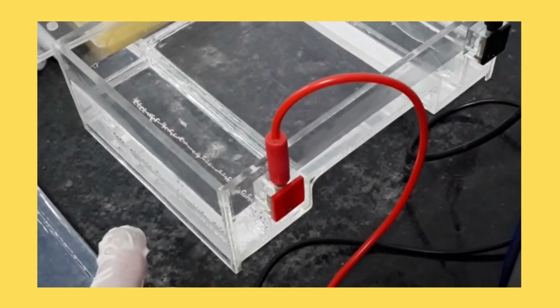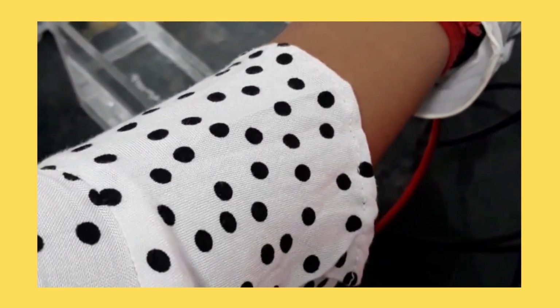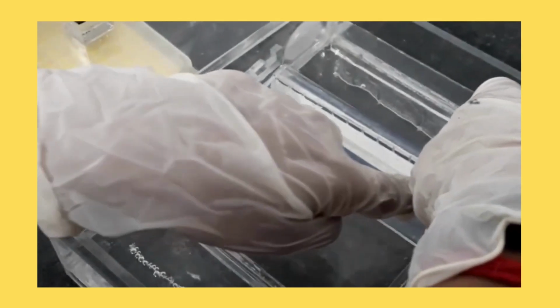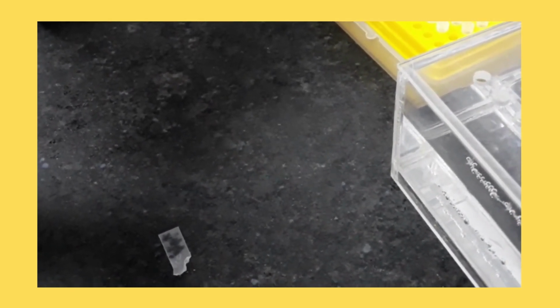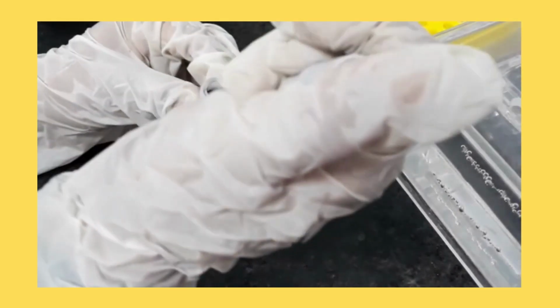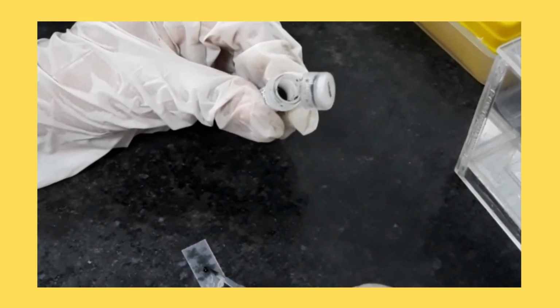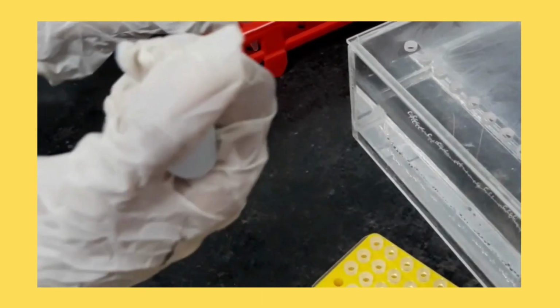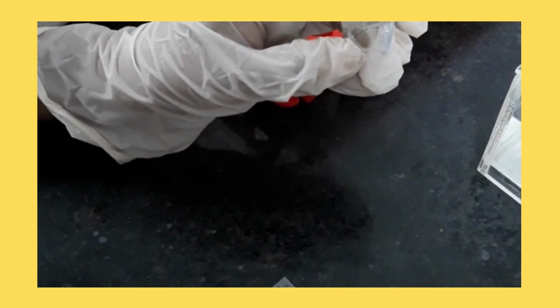Place the gel plate into the buffer system. Now take 1 microliter dye and 4 microliters sample, mix it properly and load into the well.